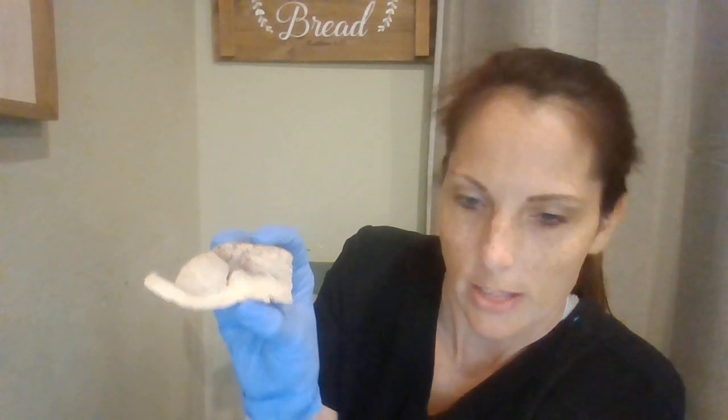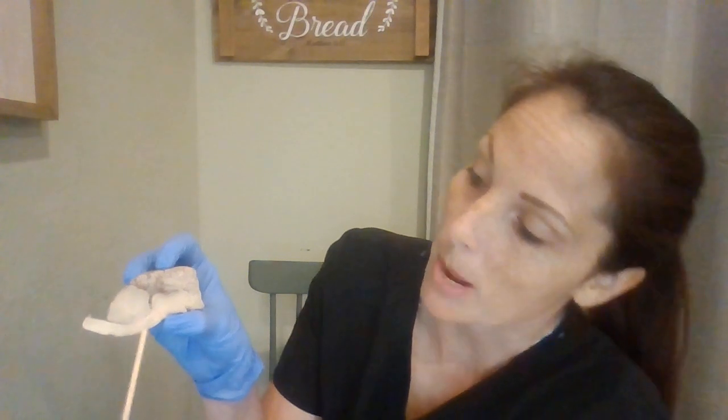I wish you could see it better on my screen. Anyways, this is where the white and the gray matter are. And they say that the white matter, it's really hard to see on this brain or differentiate between the white and the gray matter, but this is the cerebellum, and the area where it is the tree-like structures in here.